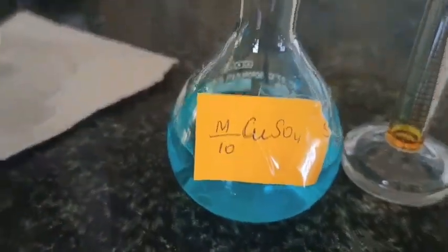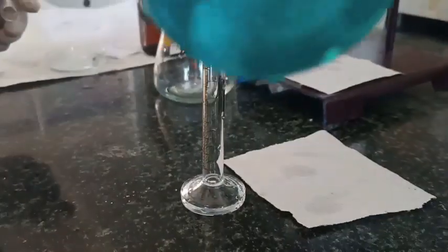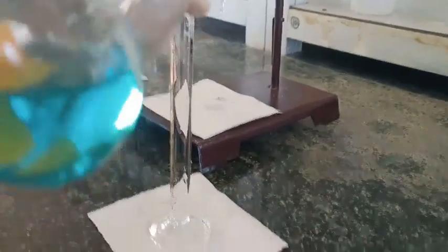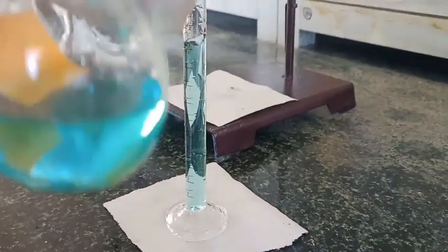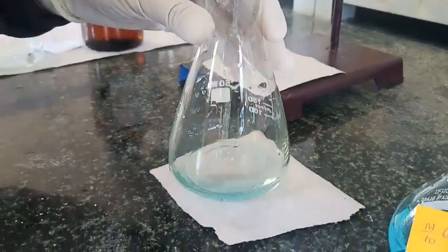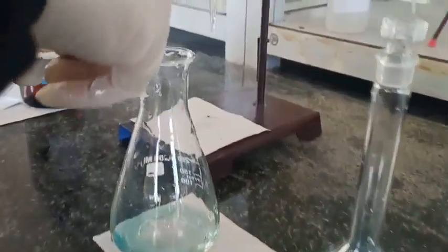Now I again rinse the conical flask with this copper sulfate solution, and I'll take 10 ml of it. Now I'm going to transfer it to the conical flask, and I'm going to add potassium iodide.